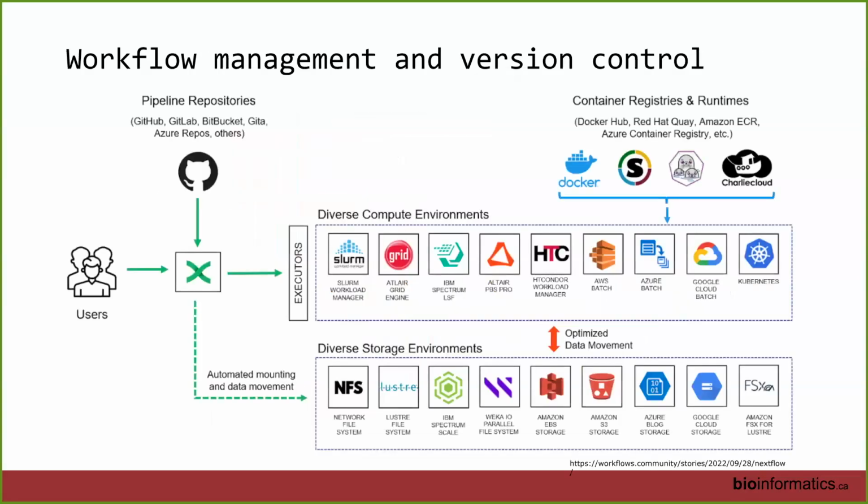You can then overlay this using something like a workflow management system, like Nextflow or SnakeMake, onto high compute systems. Don't worry about all these icons. I just wanted to show you that you can integrate this into high performance computing, such as what we're doing on the cloud today and during this workshop, using a number of different software and services. And that allows you to then further layer onto the reproducibility and the structure essentially of your workflow.